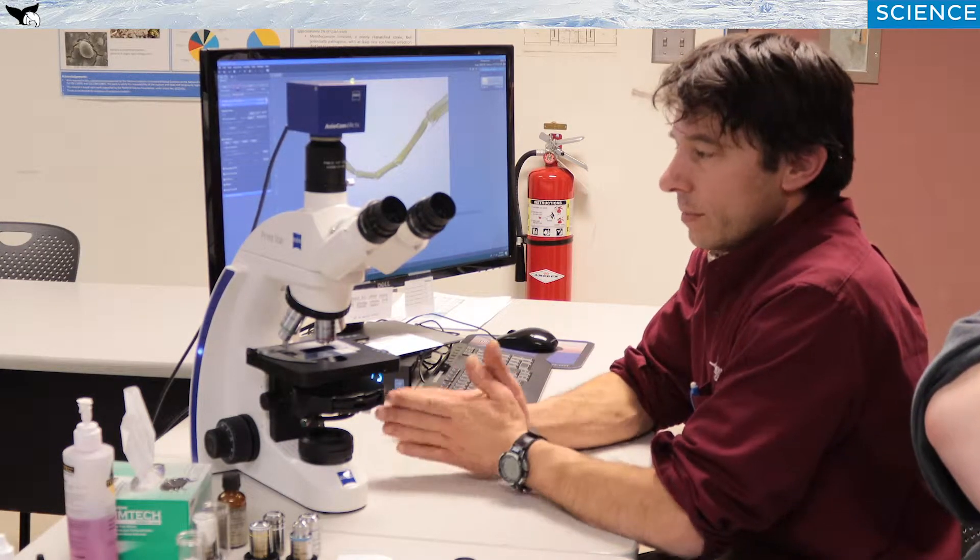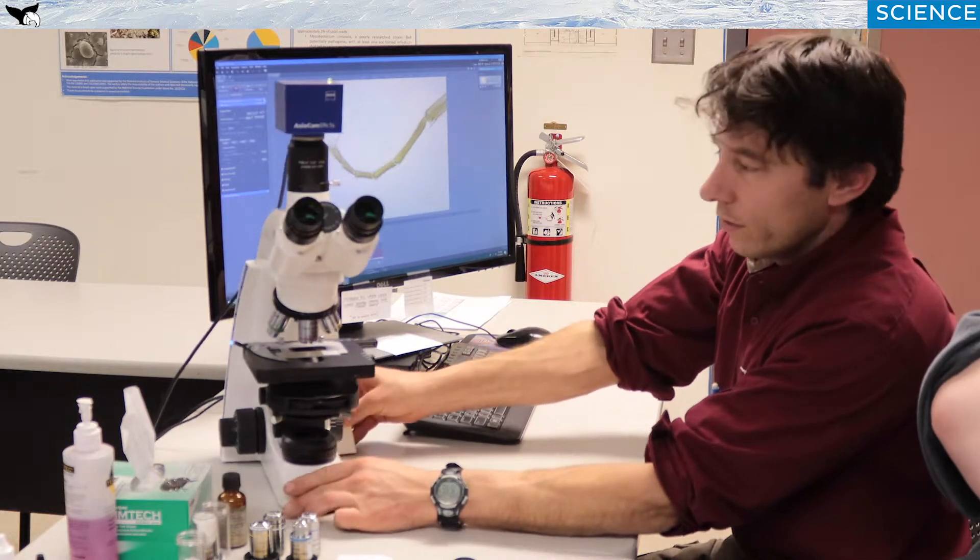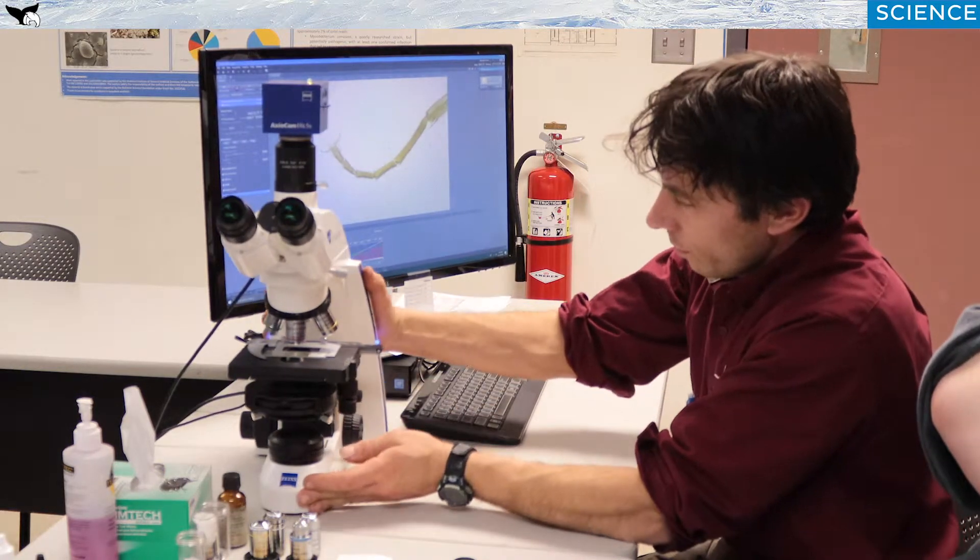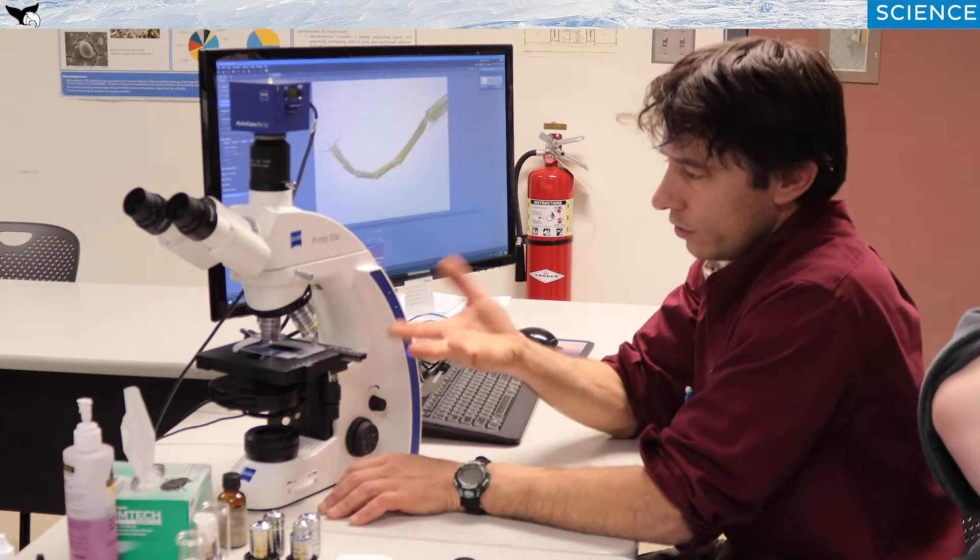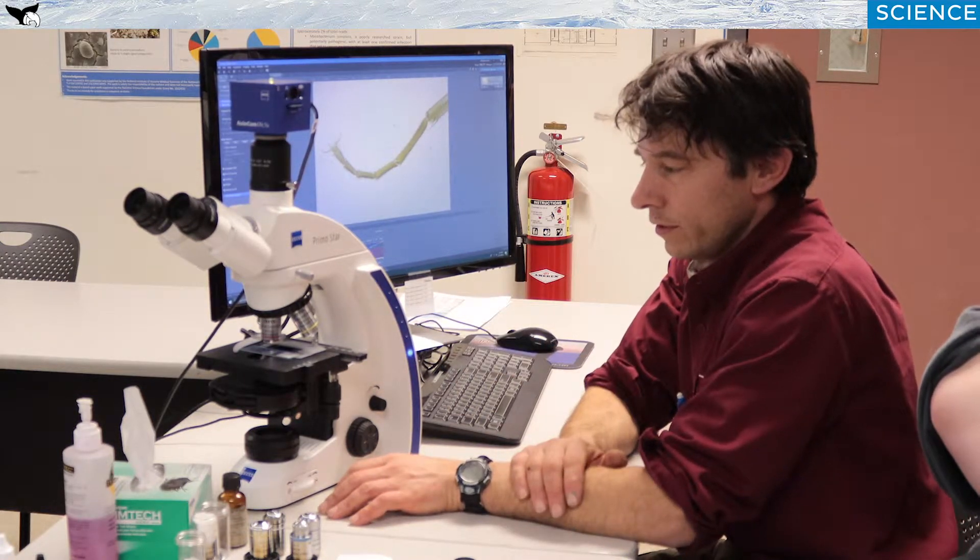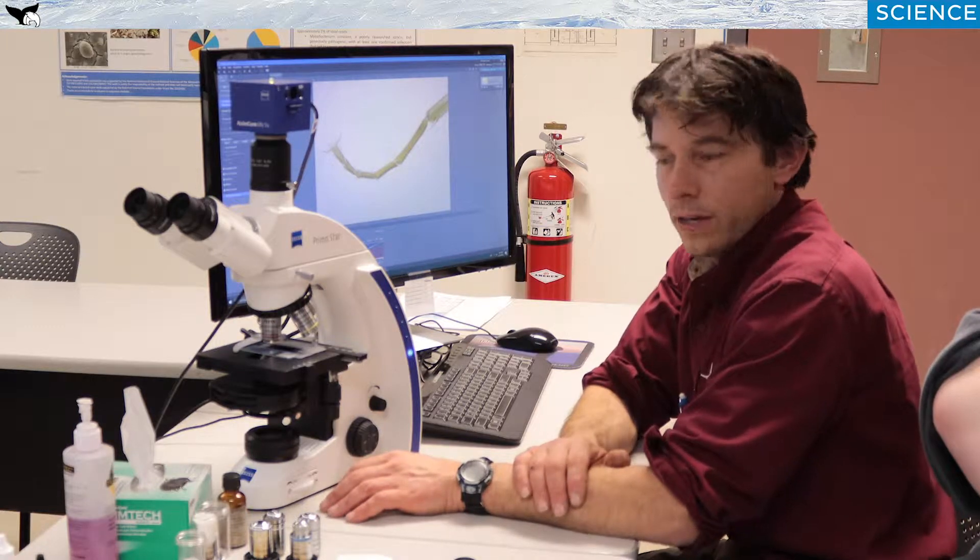So to begin with, this is a compound microscope. There are many different types of microscopes, but this is the most common. Some are inverted, which are used for tissue culture, and then there are dissecting microscopes which are used for lower magnification.